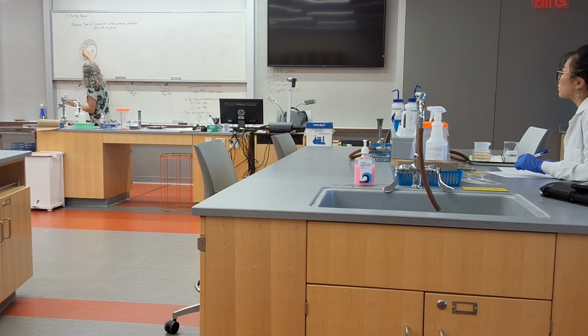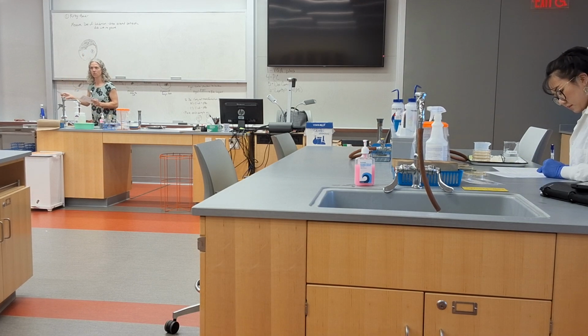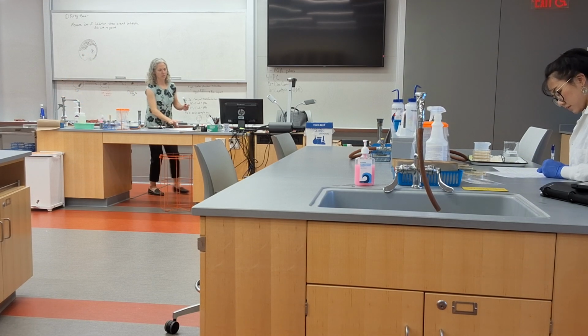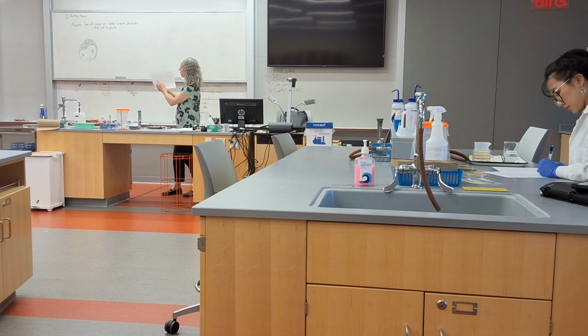One, think of it, it can be at any angle. So in this case, I would not try to measure in this way, but I would try to measure the diameter this way. Or if you could at least get the radius, which is from the center of the disc outward, then multiply that number by 2. Okay? So that's what you will be writing in for zone size under each species, and you're listing the 4 antibiotics on the left-hand side.